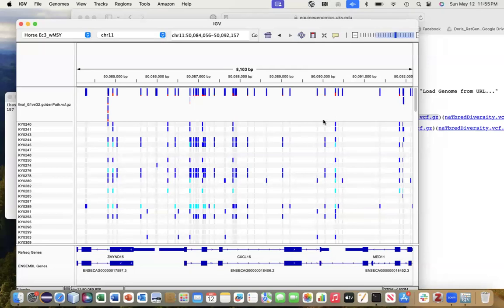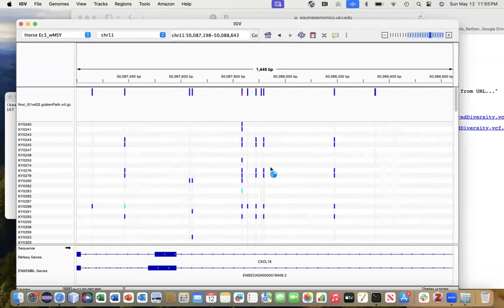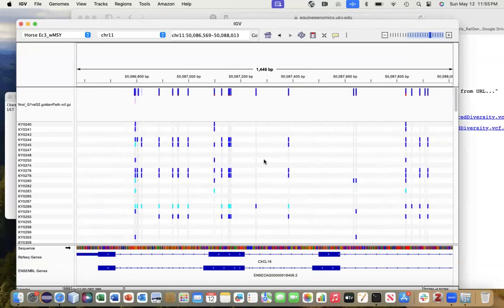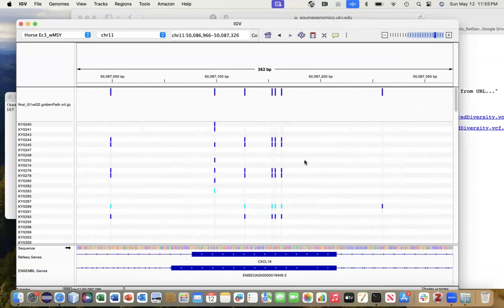What can you do with this? Really much of anything that you would want to. So I'm going to zoom in here to an exon where I know there's an interesting cassette of polymorphisms. Going to get in a little bit closer. And here we see an animal that has 5 polymorphisms within about 50 or so bases of one another. That's kind of a lot.